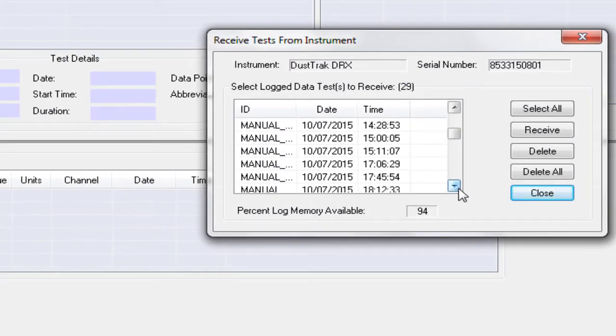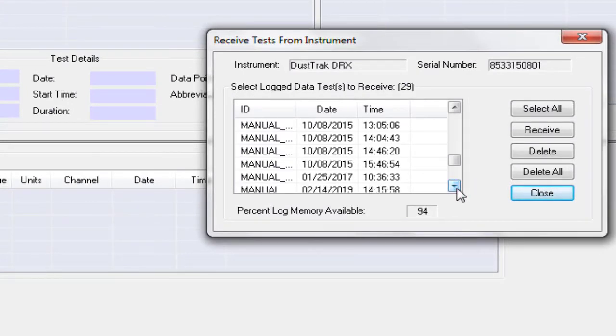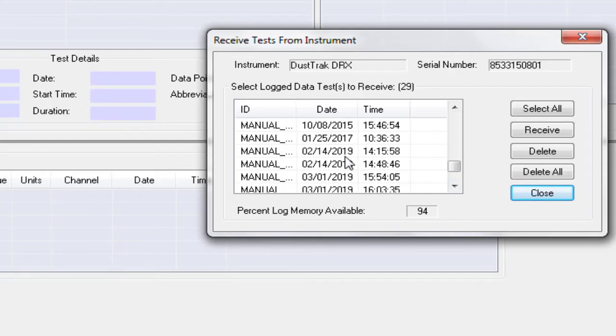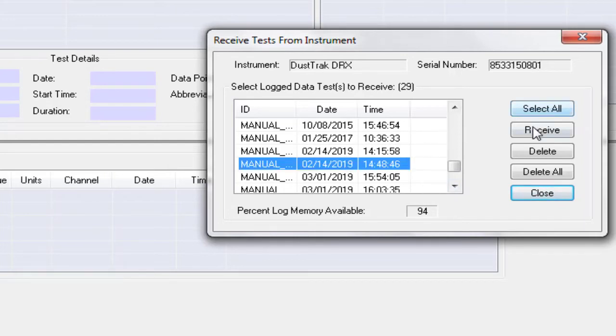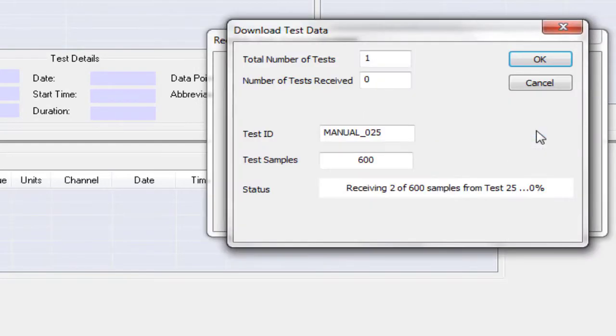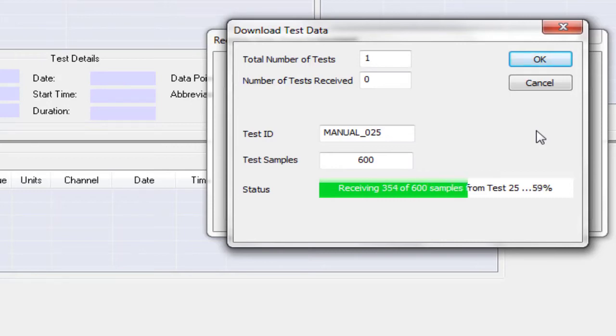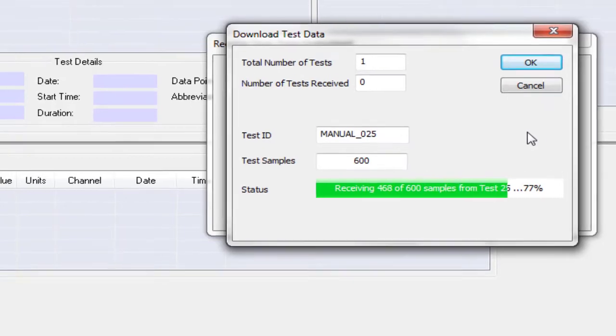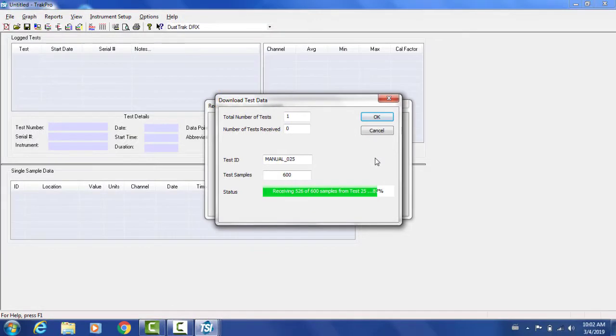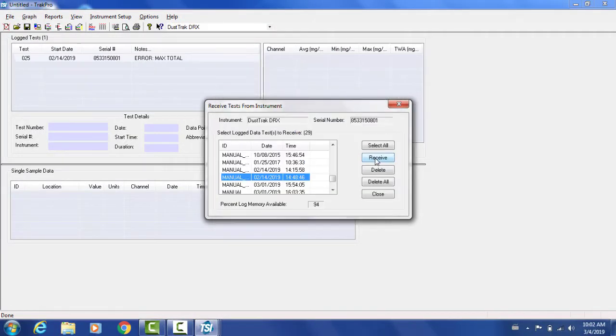So the data has been extracted and I'll go ahead and select the data that I want. It is displayed by date. I know the date and time for which I did this. So I will just select that particular file and receive it. It says it is 600 samples, which sounds about right because I recorded for 10 minutes at each second. So this is what I actually expect.